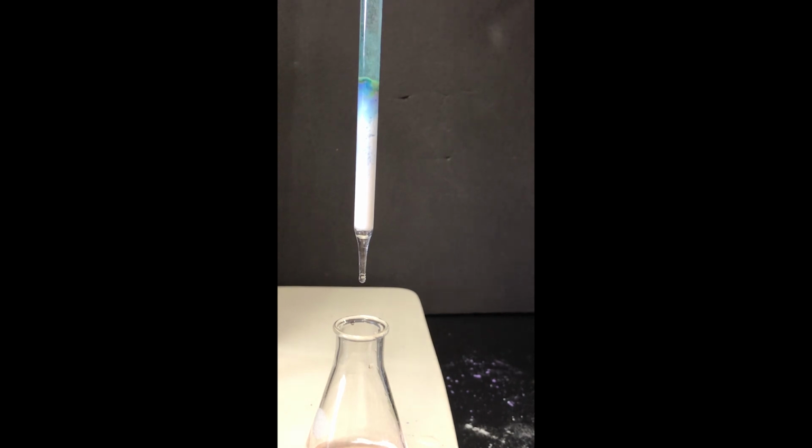We've already seen a crude example of liquid chromatography in the previous video. Here we have a silica stationary phase, and I'm manually applying a mobile phase and pushing it through. Now this is a pretty crude example, but silica is going to be the basis for the column packings in most LC stationary phases. And then we're going to do as we have here, where we put a mobile phase, we push it through with a pump, not with me holding a pipette bulb. And by giving a mobile phase that the compound has an affinity for, it passes through the column and is eluted at the end of the column where it is detected by something besides just us looking at the colors when you're actually doing a real LC experiment.